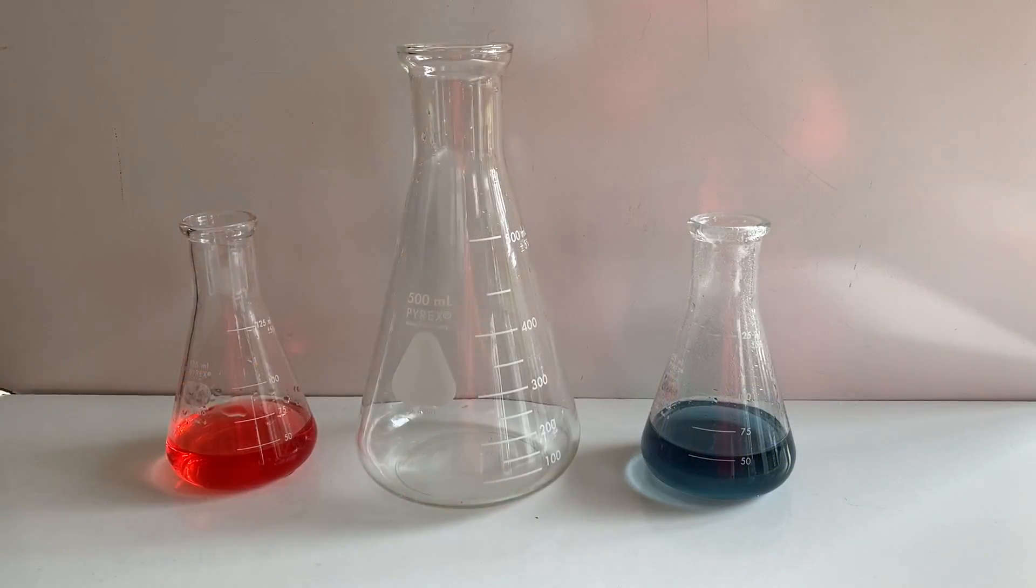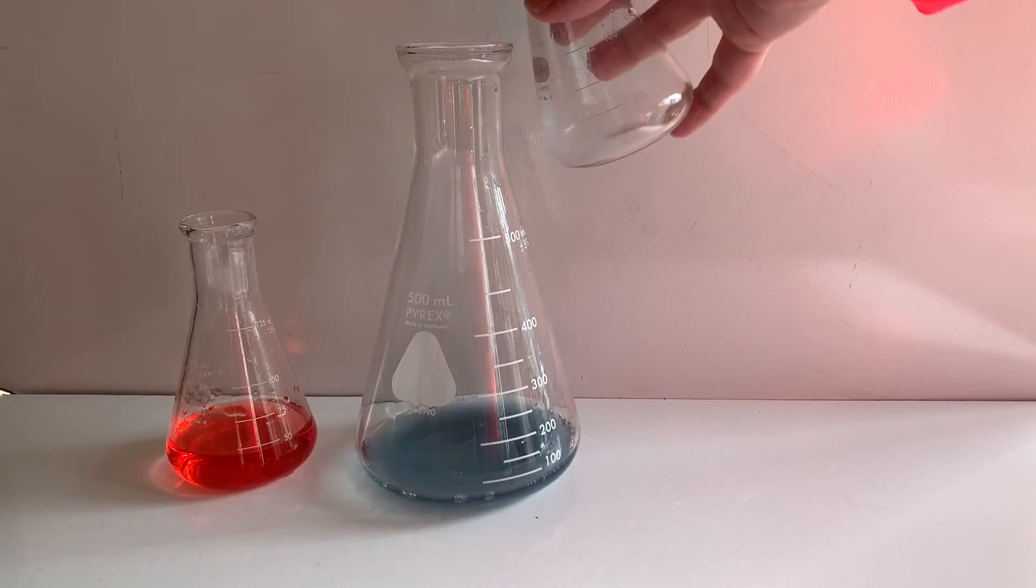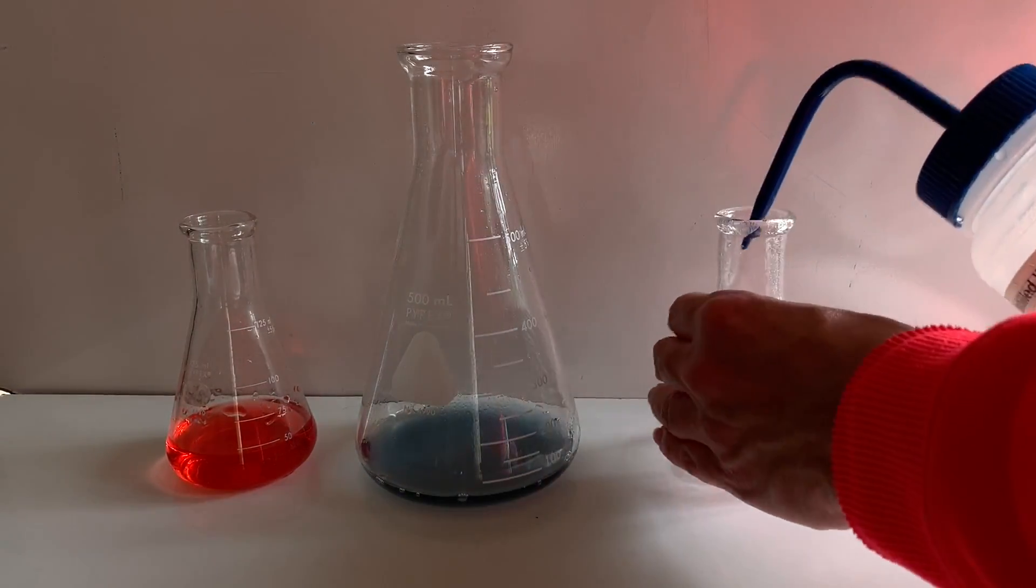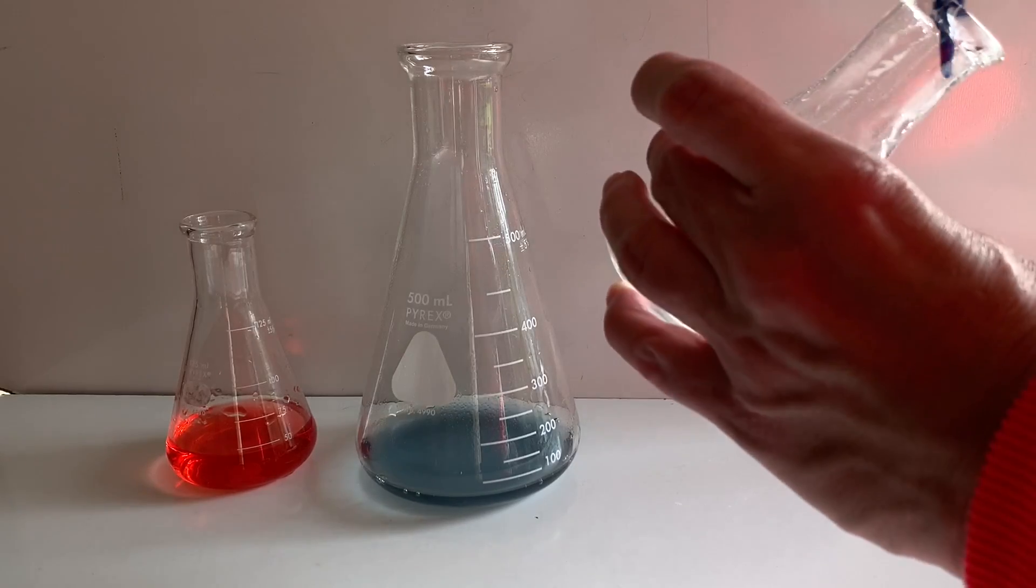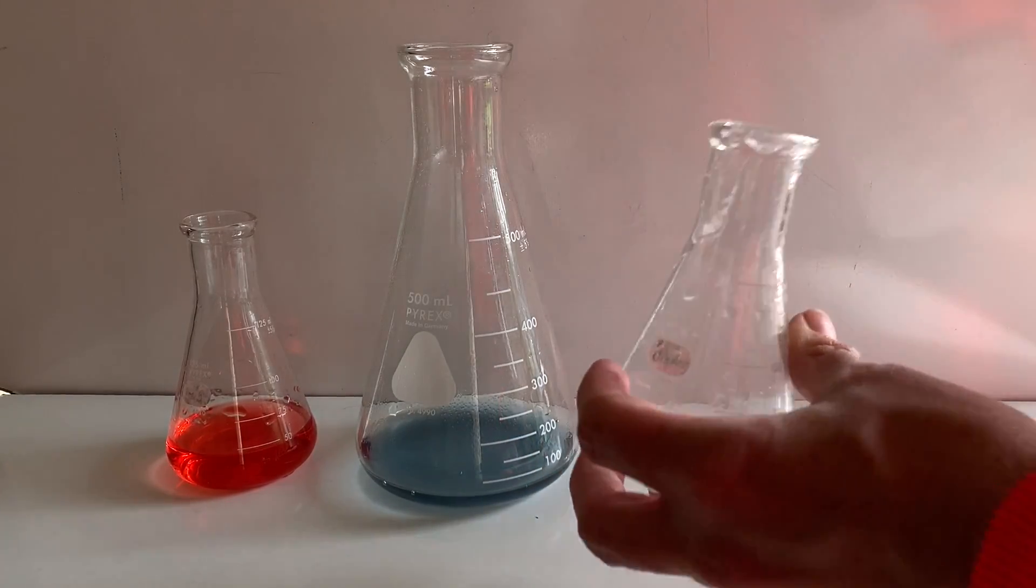The two reactants, sodium bicarbonate and acetic acid, are placed in a larger Erlenmeyer flask for the reaction to take place. I'm rinsing down the inside of the smaller flask so that I remove all of the measured sodium bicarbonate and acetic acid to take place in this reaction.